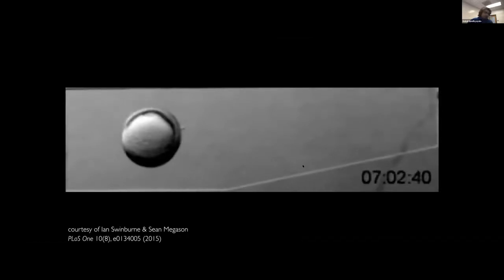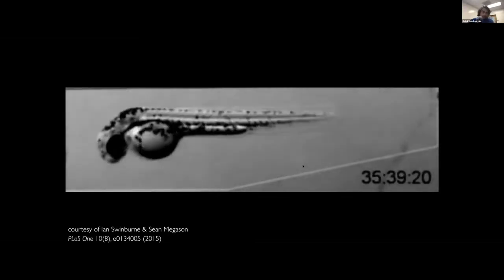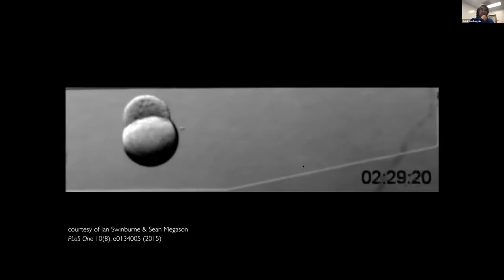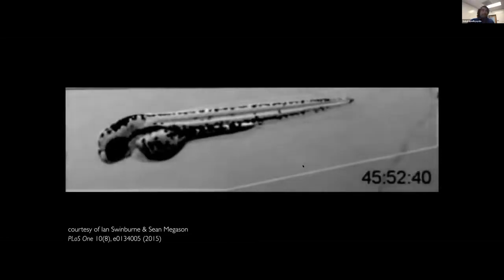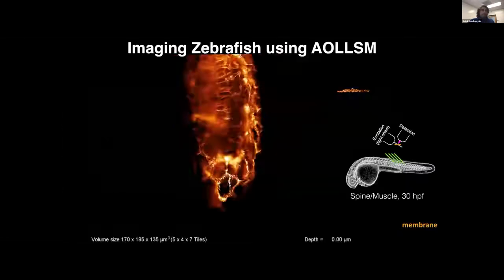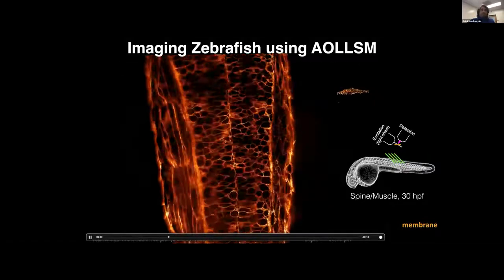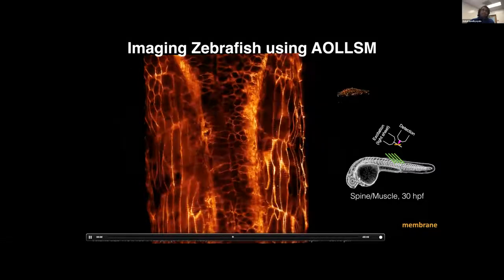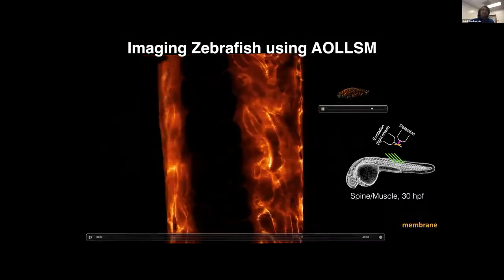So this is great because we were able to image organoids, but we want to be able to now move on to image in more complex systems. So one of our favorites is zebrafish, because like us, it's a vertebrate and it's mostly transparent. So we've gone ahead and done the adaptive optical lattice light sheet on these zebrafish, and I'm going to show you a few examples. But just to give you a sense of scale, that's that single cell I was showing you that was kind of turning.